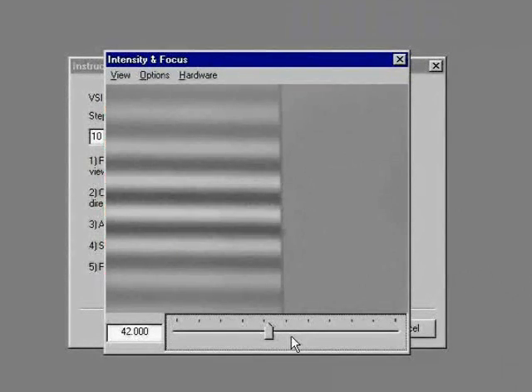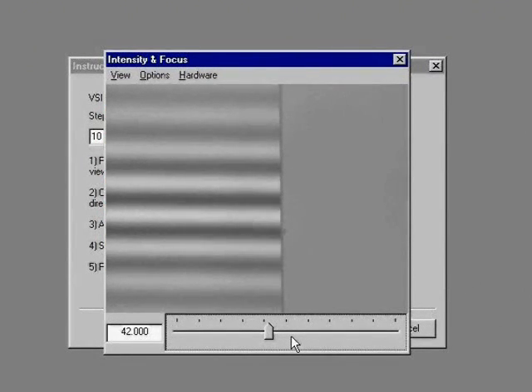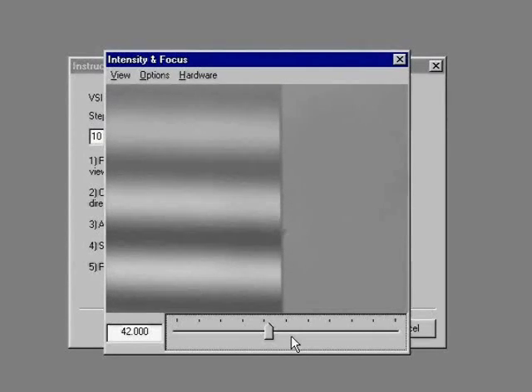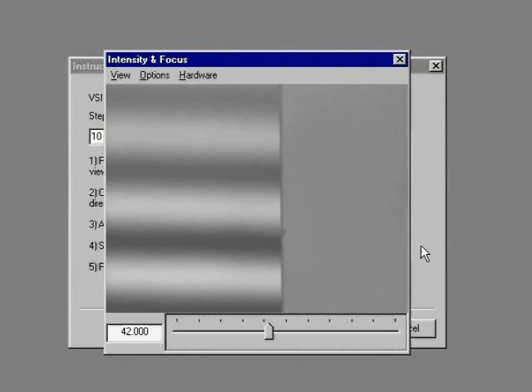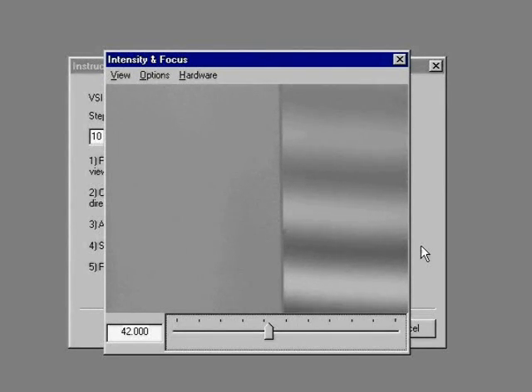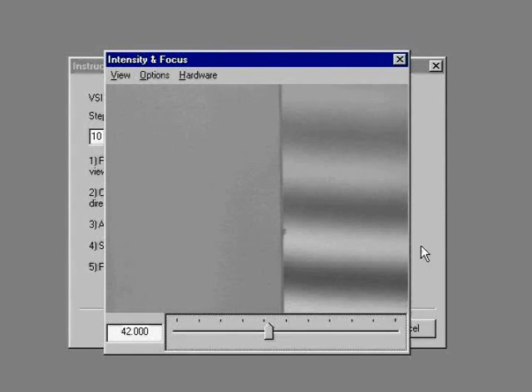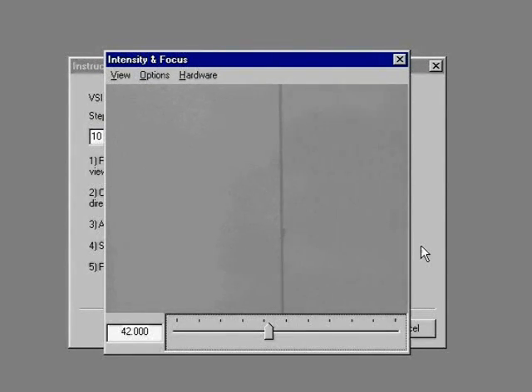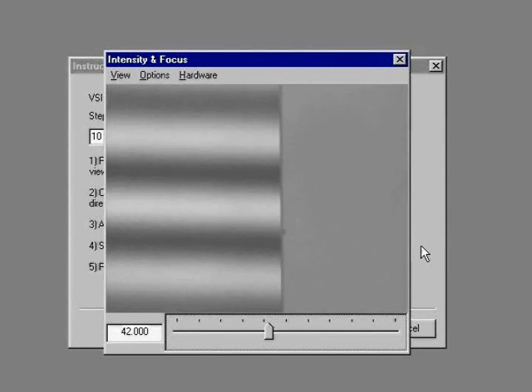Decrease the illumination to eliminate the red color. We can adjust the focus until we have the best contrast. We also want to focus on both the top and bottom of the step to make sure we can determine which is higher. Move the focus knob to the left and we should see the fringes appear on the lower step. Move the focus knob to the right and the fringes will appear on the upper step. We always begin to scan with the fringes on the upper step of any substrate.